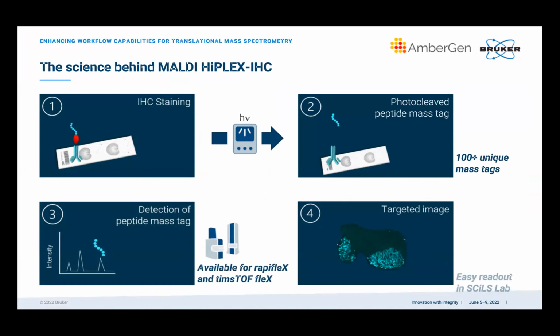So there are options in your experimental design to leave behind tissue. There are also published studies showing that you can go through and ablate the entire piece up to 3 times before you run out of material present, because it's 10 microns thick. So yes, you do then have a Z dimension that you're dealing with, but it's only 10 microns. So yeah, if it's FFPE, it's only 5 microns typically, maybe 6.